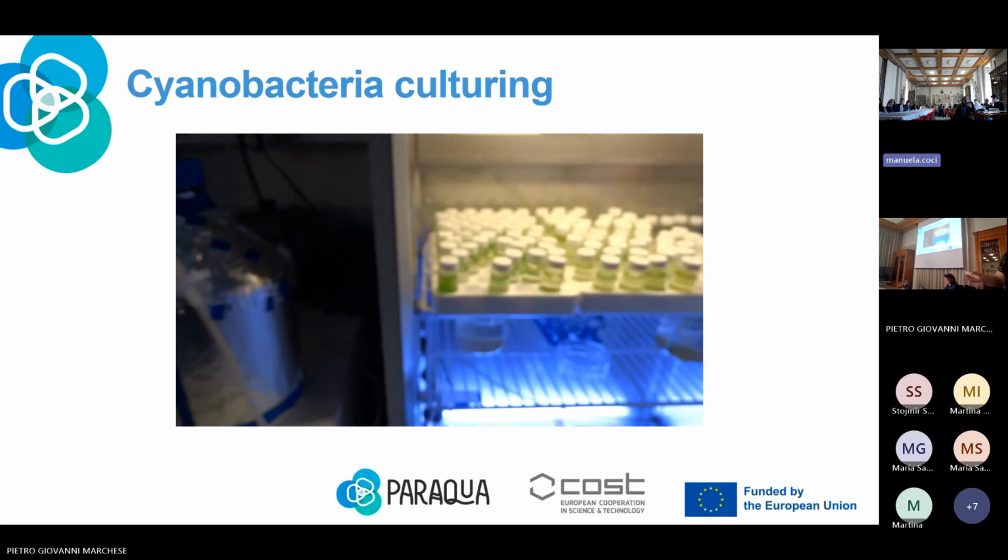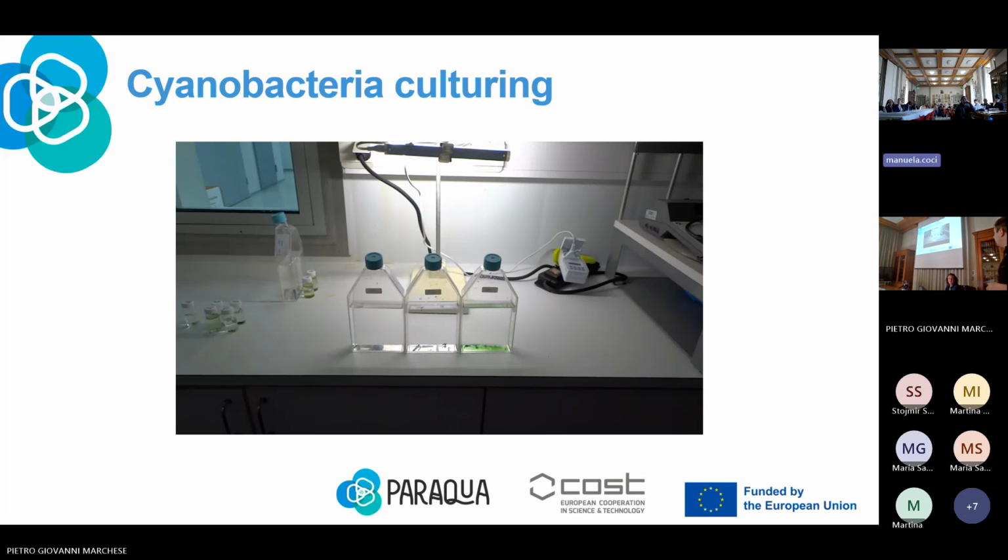It's manageable by one person when the number of cultures is up to around 200, assuming that I also have other types of work to do at the university. But the reduction of size is recommended, because we can also reduce the area in the lab for our cultures.